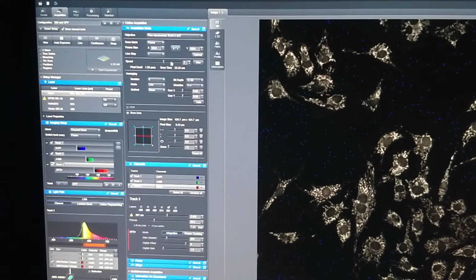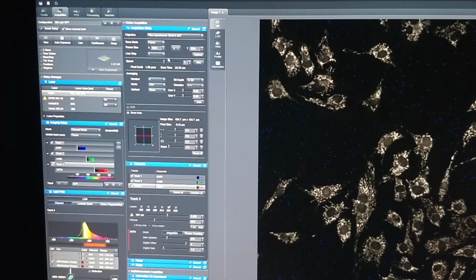Okay, it's very important to double check those 2 measurements before you acquire a picture, because they do sometimes change by themselves. Especially if I played with the scan area. Okay, so now all 3 are checked. I'm going to click on the last one, which is snap.